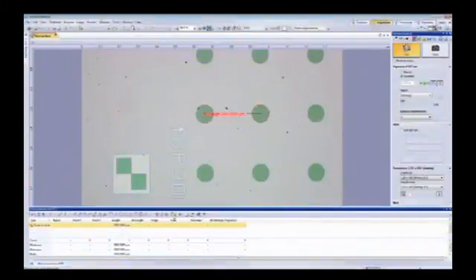So we also put in a new angle ruler. This allows you to bring a ruler out onto the screen and determine specific angles of things. So that's some of the manual measurements and add-ins that we've added from feedback out in the field of use of the tool. We also added a feature a lot of customers requested: a vertical scale bar on the image. So now we not only have a horizontal, but we can add a vertical scale bar.